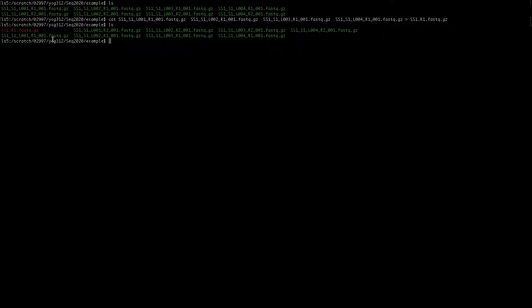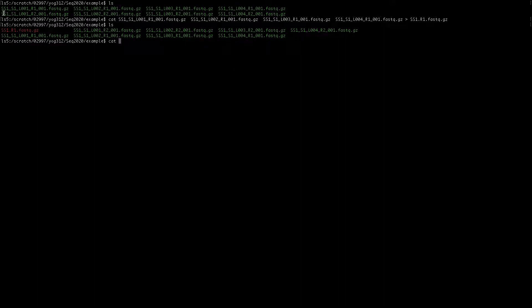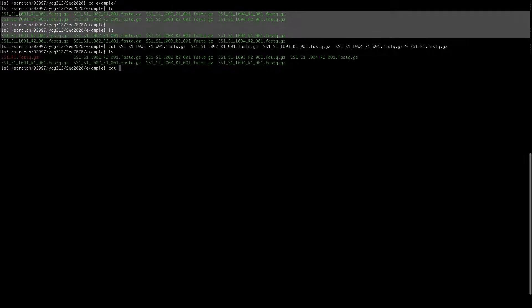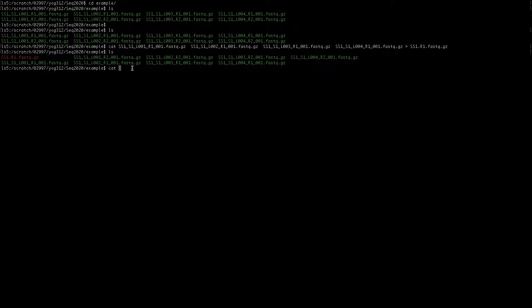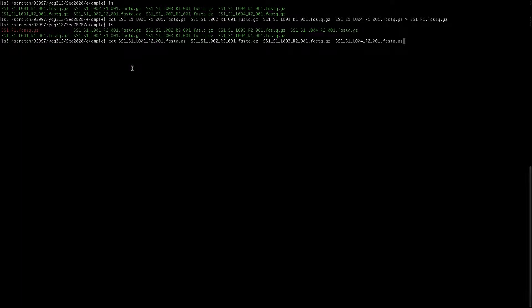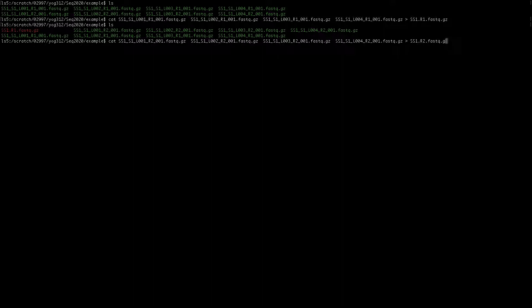We can do the same thing for the r2 file. Cat, and then I'll copy the r2 files and name it as SS1.r2.fastq.gz. That should combine the read 2 files.